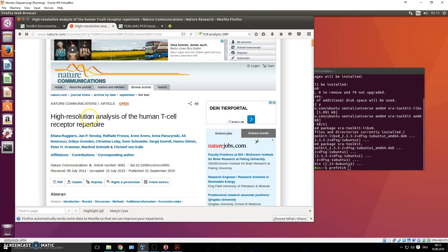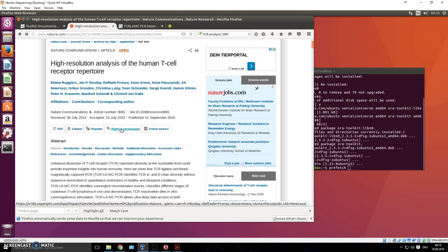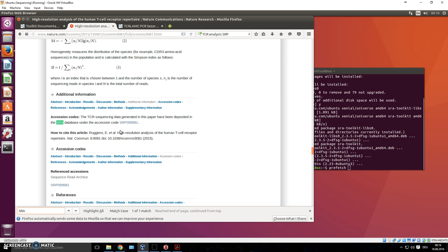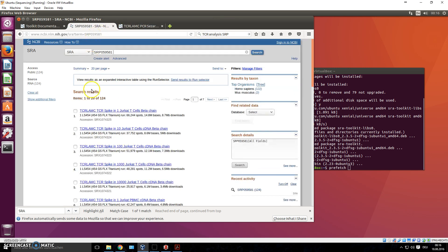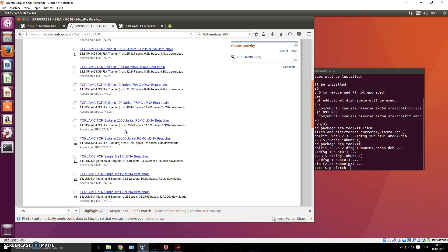I found a paper on T-cell repertoire analysis. Most of what I'll do in these videos will be TCR — T-cell receptor — repertoire analysis, since that's what I mainly do at work. I found this paper: 'High Resolution Analysis of the Human T Cell Receptor Repertoire.' They usually have an SRA or SRP database link. I searched the website for SRA and found the accession code. Clicking it takes you to the repository showing all the different samples with sequencing information.